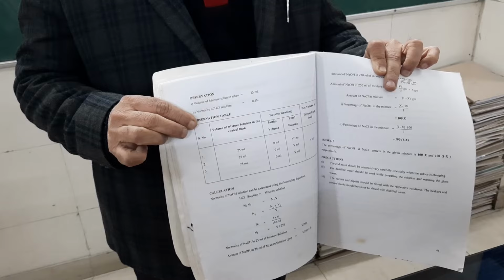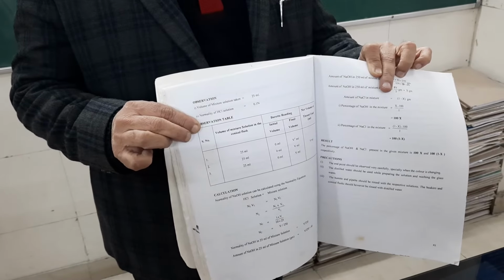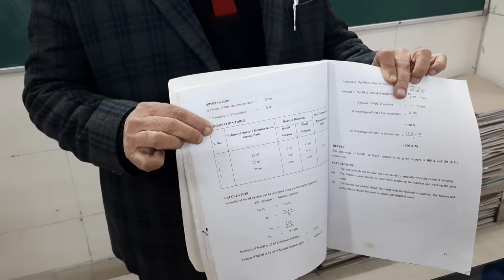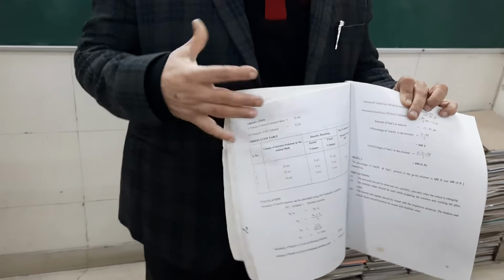Now by this reading, we will make the calculation to obtain the amount of sodium hydroxide present in the mixture.